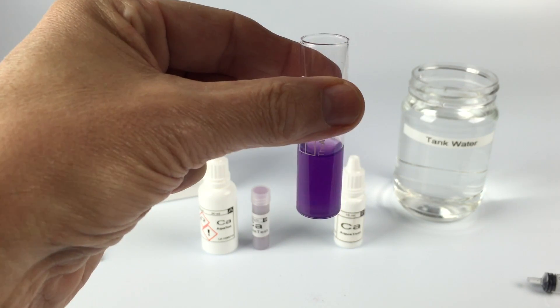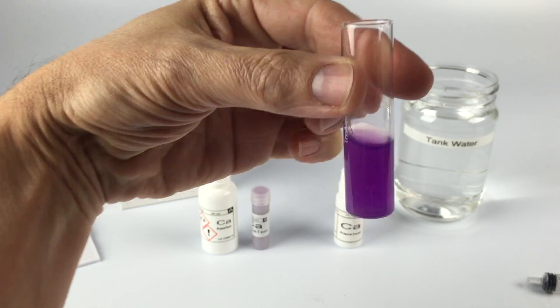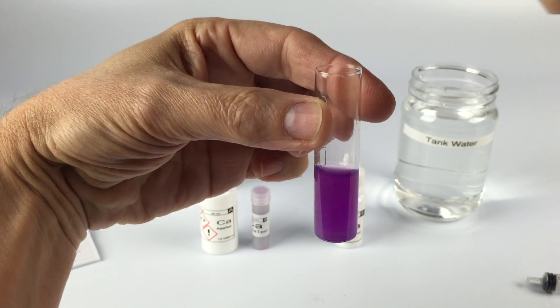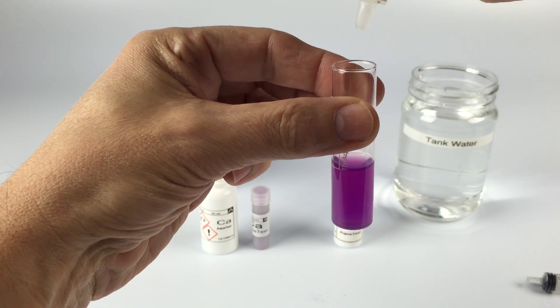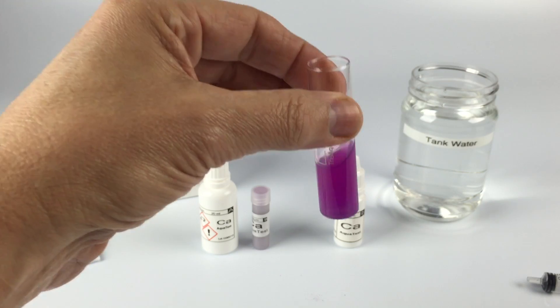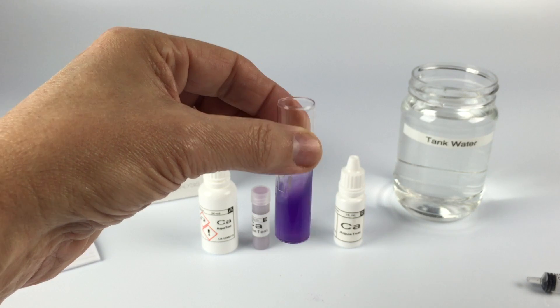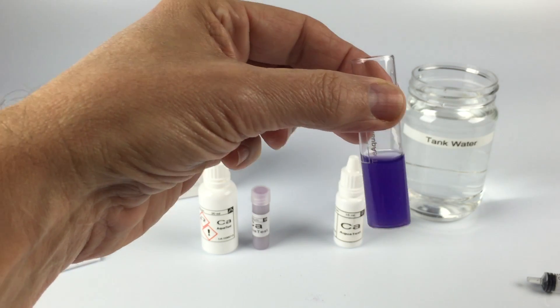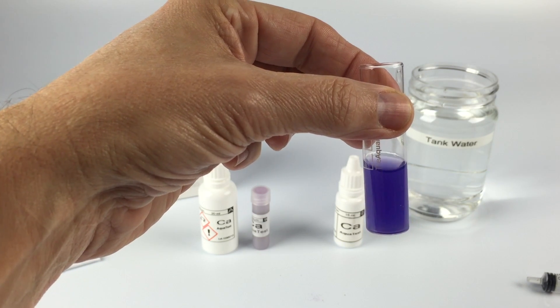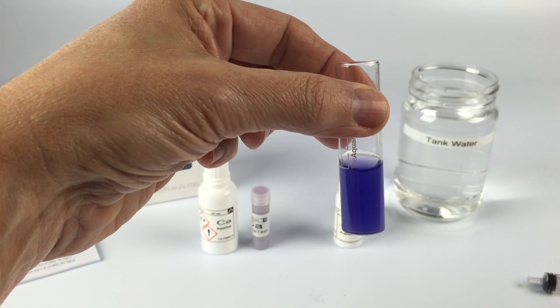7. Here's an important point: if it starts to turn pink again you need to add another drop. It's not blue — it's purple. So if we add an 8th drop it would get darker. 8. It has now turned a dark blue and you want it to stay that color for 20 seconds. If it turns back to pink, it's not enough. So 8 drops is 400 parts per million calcium.